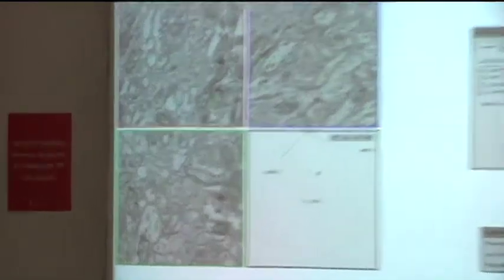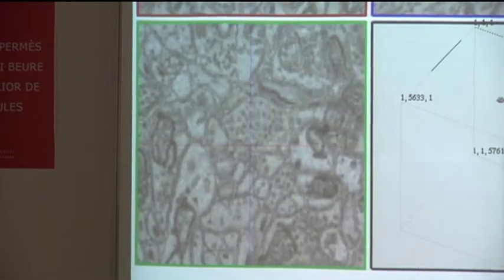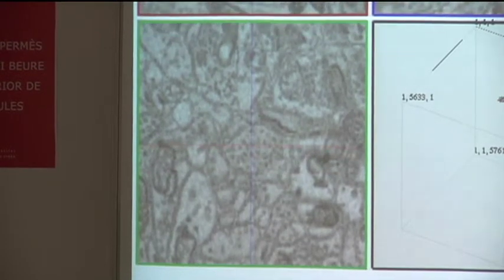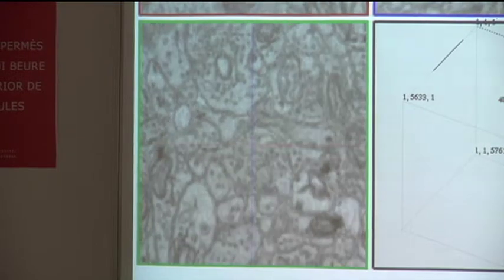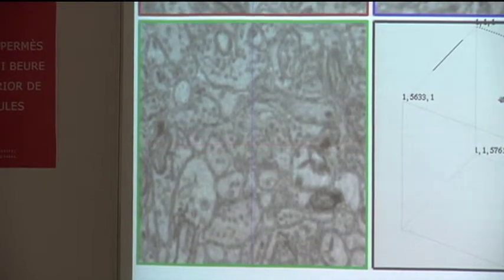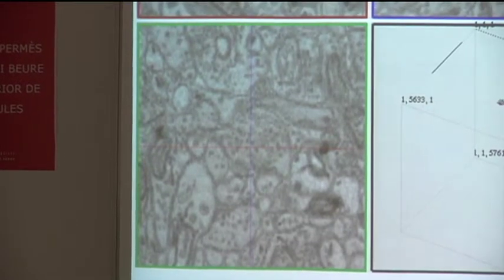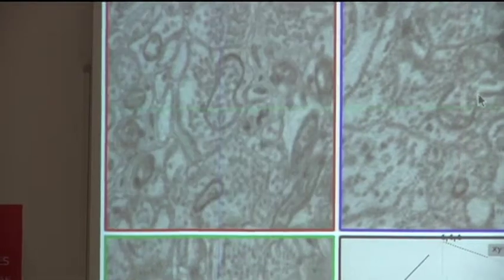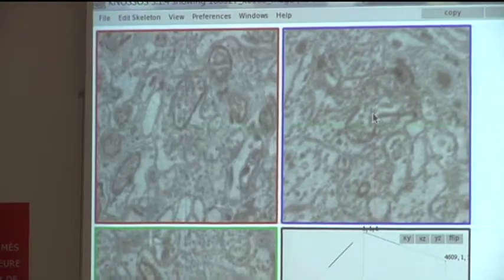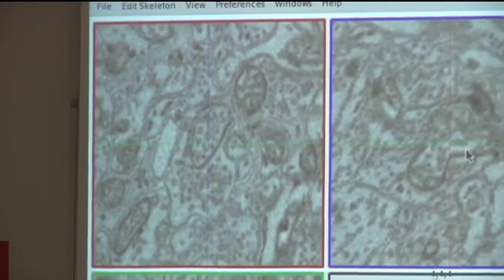These are synaptic vesicles. The contrast on the screen is not optimal, but all I have to do is move it around a little bit, and I think you'll agree that the red plane is focused right now at something that contains a lot of red vesicles. Do you agree with that? Why do I get an illusion that there are vesicles in the mitochondria? Okay, what do mitochondria contain? The textbook picture, and that is not so wrong, is what is called crista.